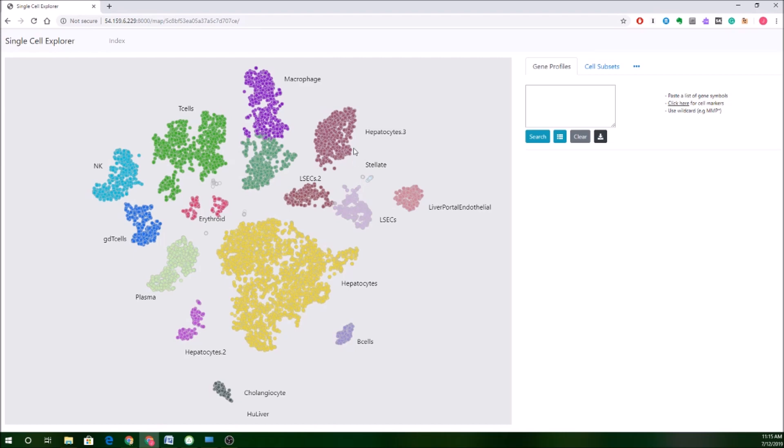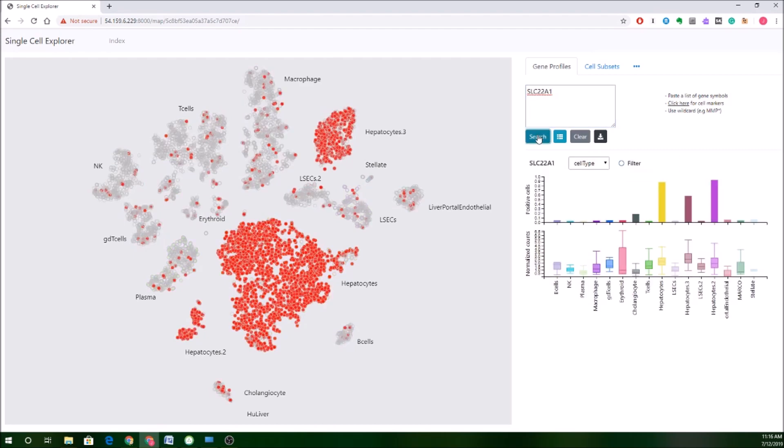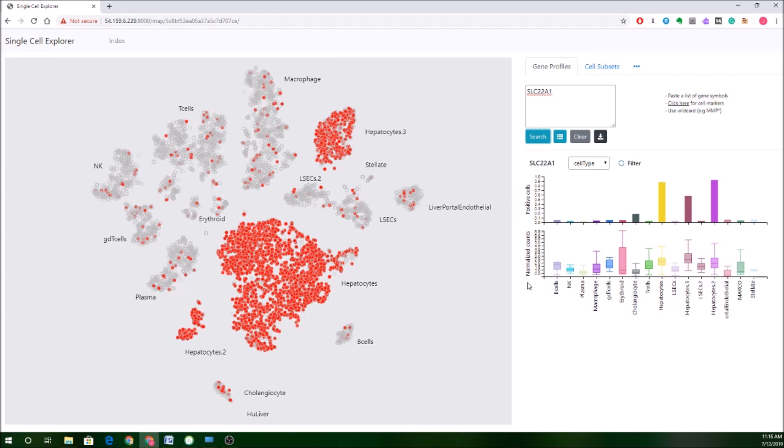Now, if I'm interested in looking for a particular gene, I can actually go over to this box and then type it in. So here I'm going to start with a hepatocyte-specific transporter. That's SLC22A1. So I just punch that in, click search, and you'll see that fairly quickly we get an update of this view here to color the cells that are positive for expression of that gene. In this case, it actually lines up pretty well with our biological interpretation. We're getting good expression in this hepatocyte cluster as well as this one and this one.